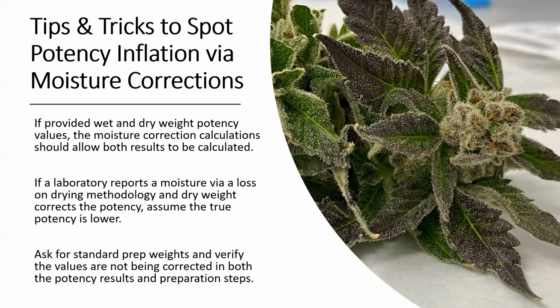And sample weight should be, for example, 0.2035 to 0.2001. There shouldn't be a big variation up and down of what their standard protocol calls for. So in that instance, that's an example of the protocol calling for a weight of 0.2. Really, in an ideal lab situation, you should be weighing between 0.1950 and 0.2050 for that type of sample.